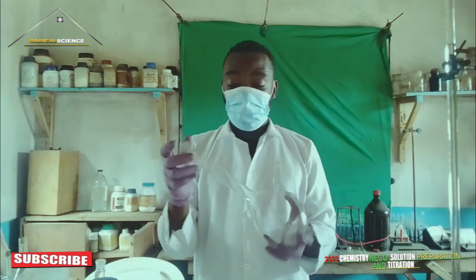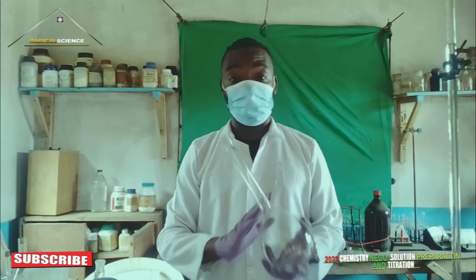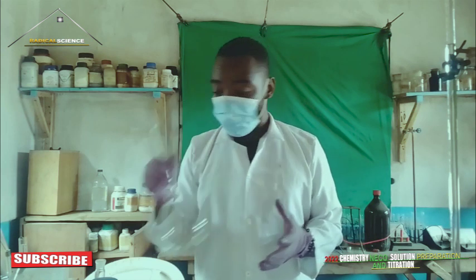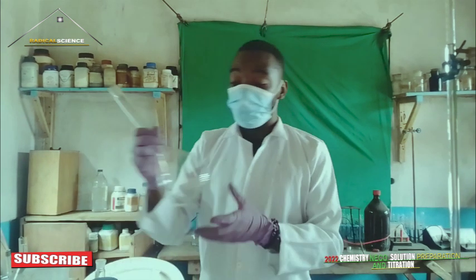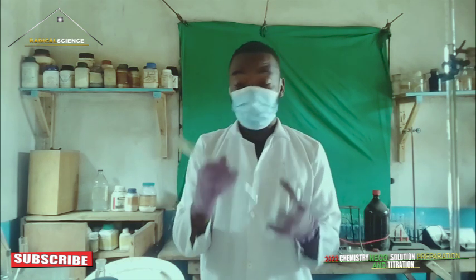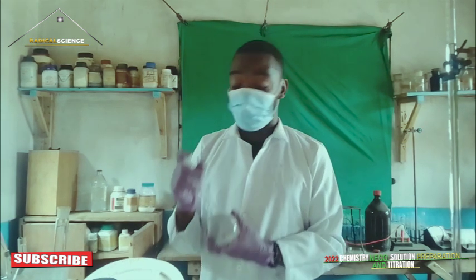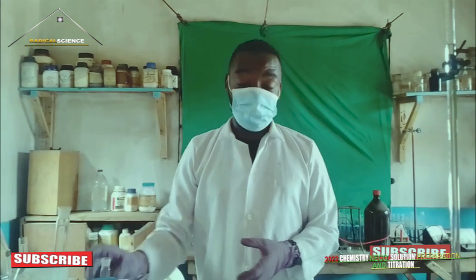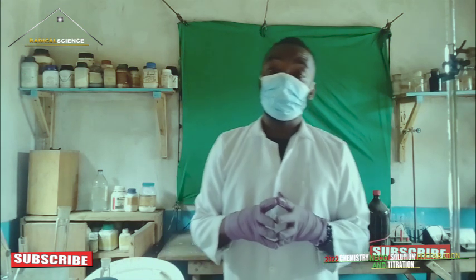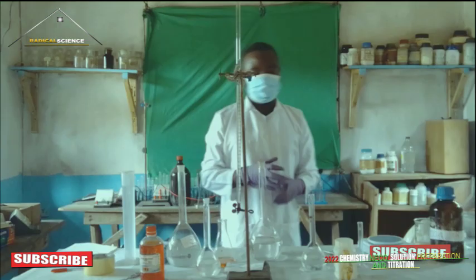As you can see, once it gets to this particular line, it is 1000 ml, which is equal to 1 dm cube. In case you don't want 1000 ml, let's assume you want 250 ml, all you need to do is divide by 4. If you want to prepare 500 ml, you divide by 2.